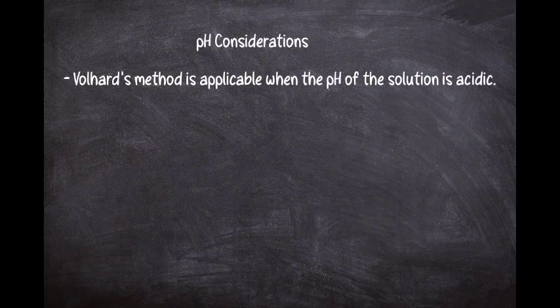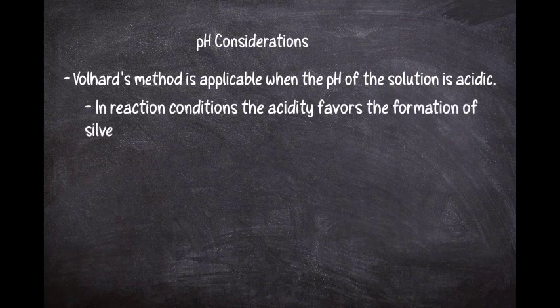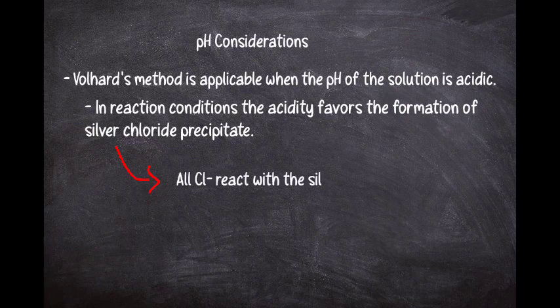Why is acidic pH crucial? Well, in an acidic environment, the reaction conditions favor the formation of the silver chloride precipitate during the initial stage of the procedure. This ensures that all chloride ions in the solution react completely with the added silver nitrate.